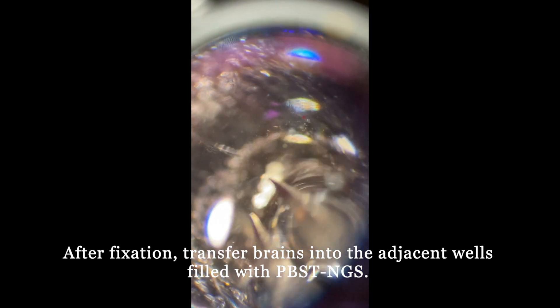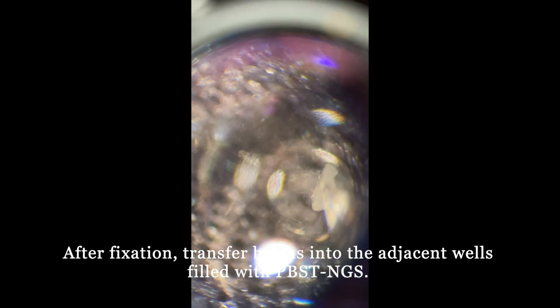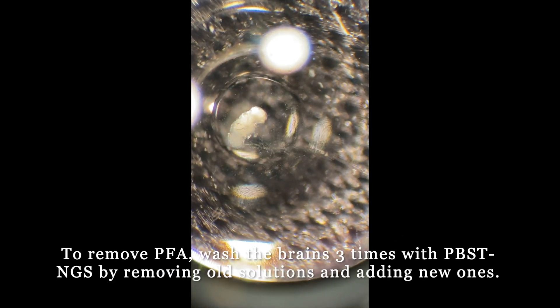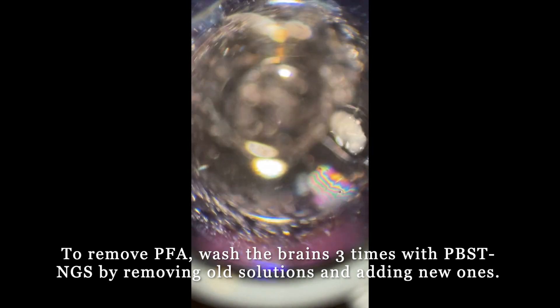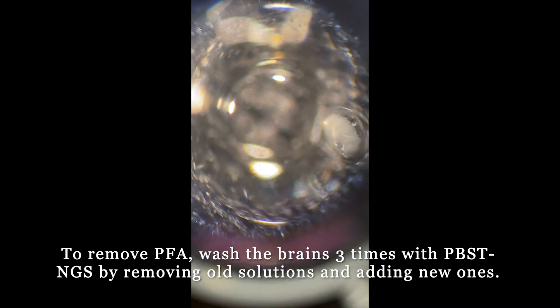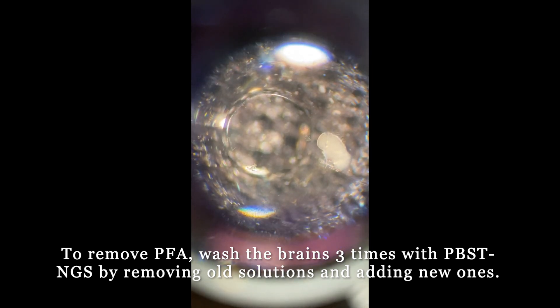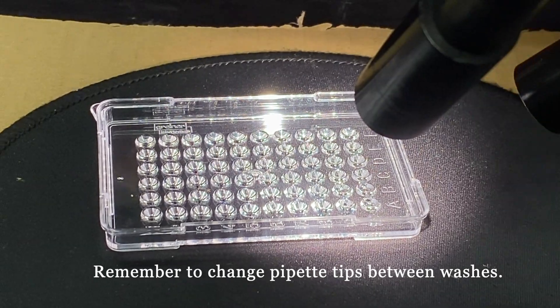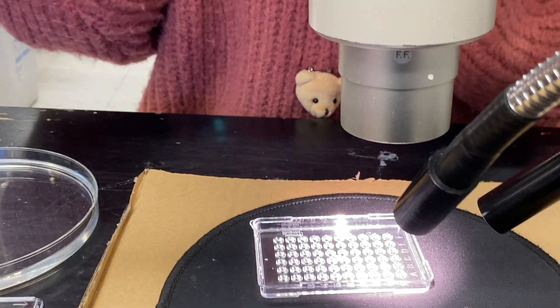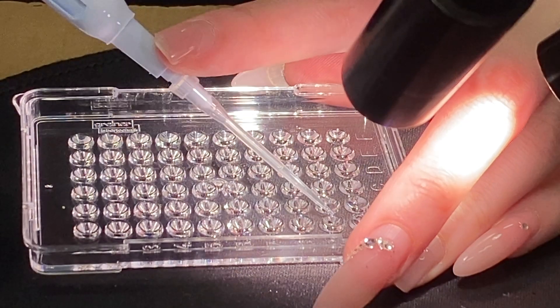After fixation, transfer brains into adjacent wells filled with PBST-NGS. To remove PFA, wash the brains 3 times with PBST-NGS by pipetting out the old solutions and pipetting in the new ones. Wait about 1 minute between each wash. Always remember to change pipette tips between washes. When pipetting solutions in and out of the wells, it helps to stabilize the pipette tip with a finger.